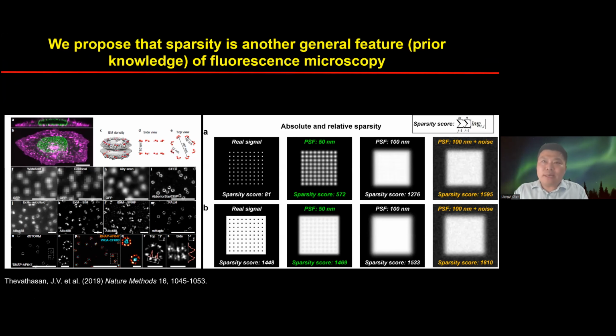So we came up with another idea. When we talk about high sensitivity, high resolution fluorescence microscopy, the high contrast and high sensitivity come from the fact that we are selectively highlighting only part of the image. What does that mean? For example, take the nuclear pore complex, which is formed by 20 or 40 proteins.